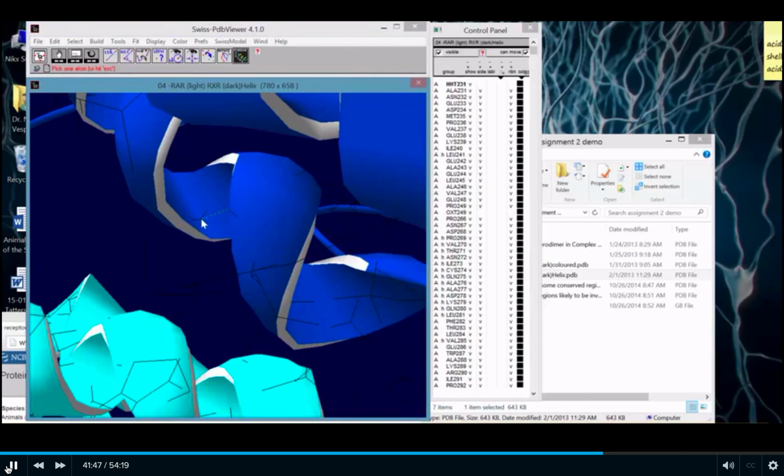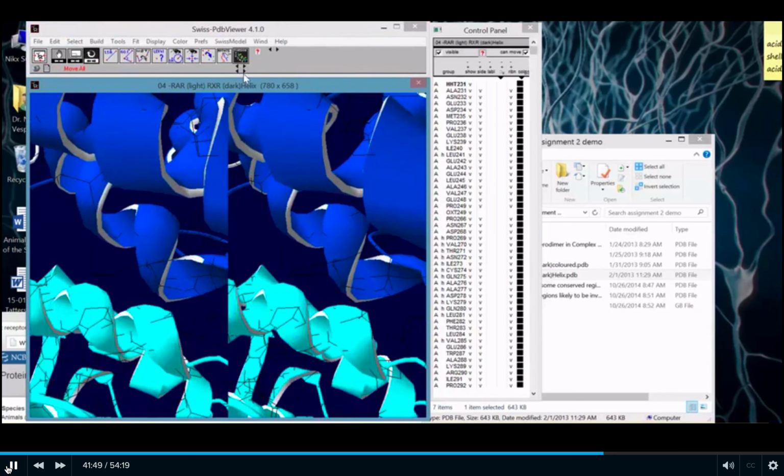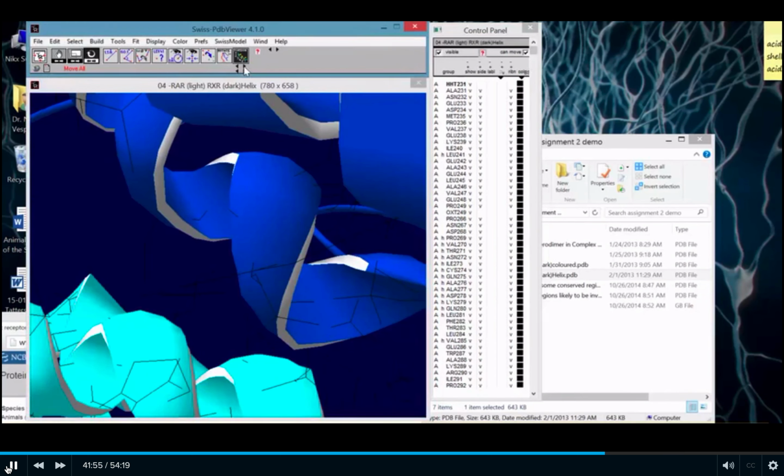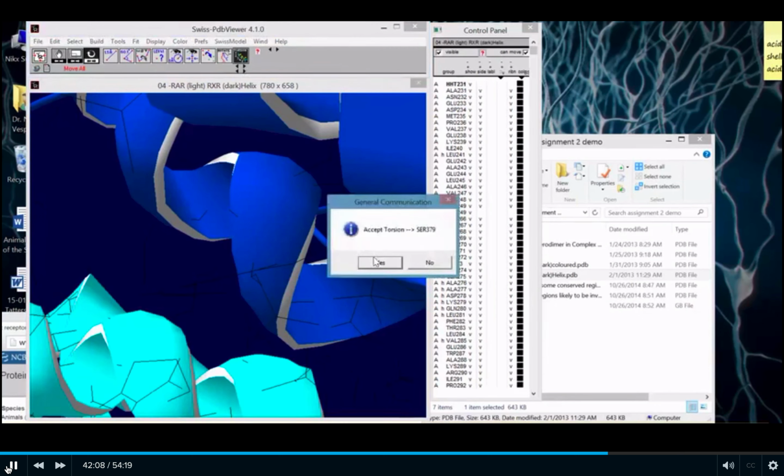Go ahead and do it. Come on. Clearly this is a little bit tricky. Definitely need a mouse if you've got a laptop. But here we go. Did you see that? Just a slight change over here, just a fraction of a millimeter. Might be enough to get me that clearance I need for my ligand, but I'm going to click and see, just a touch. Going to accept that.